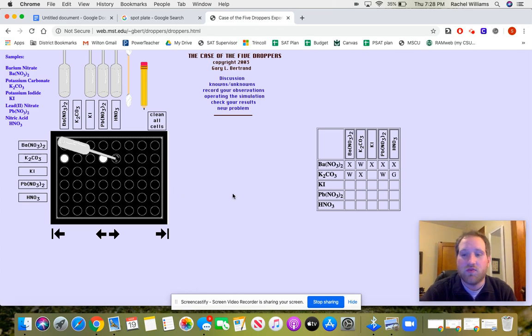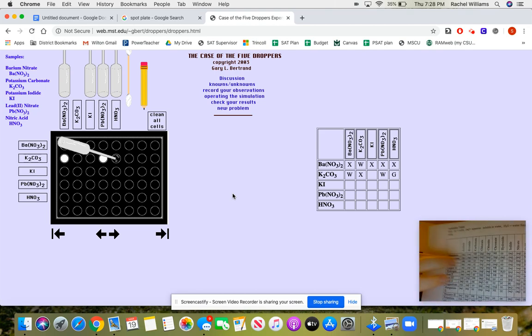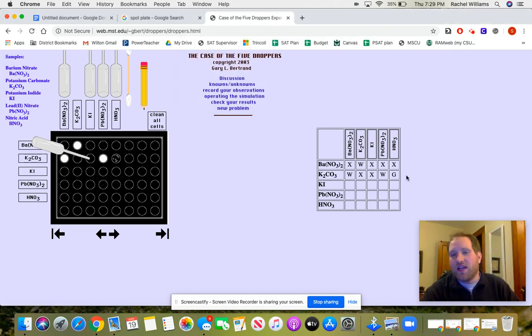And in fact, if you check your solubility table, you can figure out exactly why we saw a gas there. Oh, looks like I forgot to include one here. I want to go back and make sure I fix that. So I'm going to point back to this one, and I'm going to hit my pencil, and we saw no reaction. There we go.